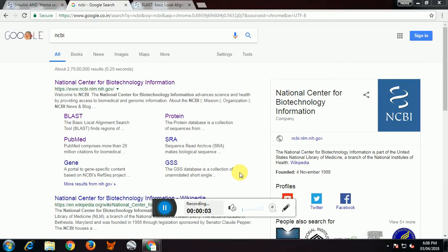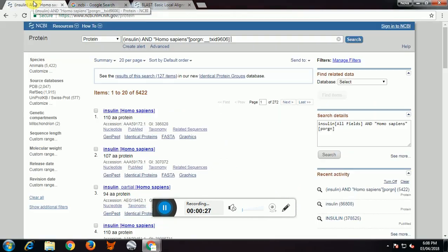Hi friends, welcome to the series of introduction to bioinformatics. Previously we have used BLAST for nucleotide. In this video we will discuss how to use BLAST for protein sequence. Our main requirement is a protein sequence in FASTA format or an accession number of protein. We will keep insulin as our example — insulin protein of Homo sapiens as our query sequence.